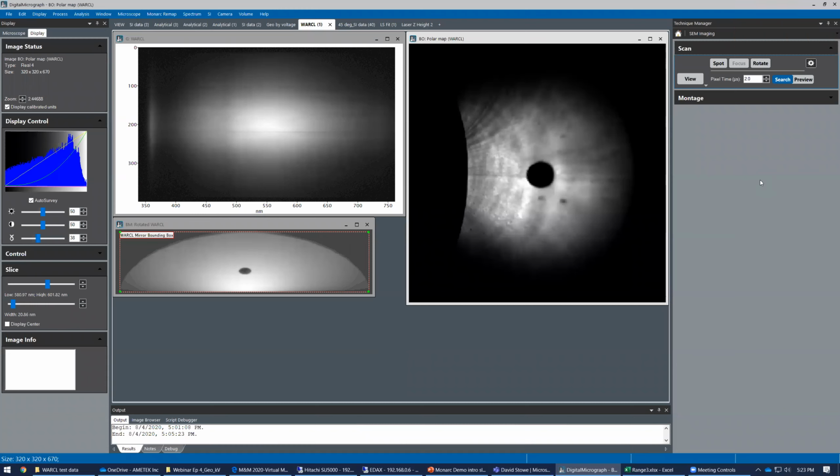That can get better if you have a cryo stage, right? It can. Again, though, it's determined by your ability to focus the beam spot. If you're really good at focusing the beam spot, then I would agree that even if you go cryo, it'll shrink the generation volume once it meets the sample. But why does cryo shrink the generation volume? Sorry, it's a very basic question. Because once the carriers are excited, they travel around in the specimen before they recombine. They have a little bit of a diffusion length. Got it. They're going to interact with all sorts of things by then.